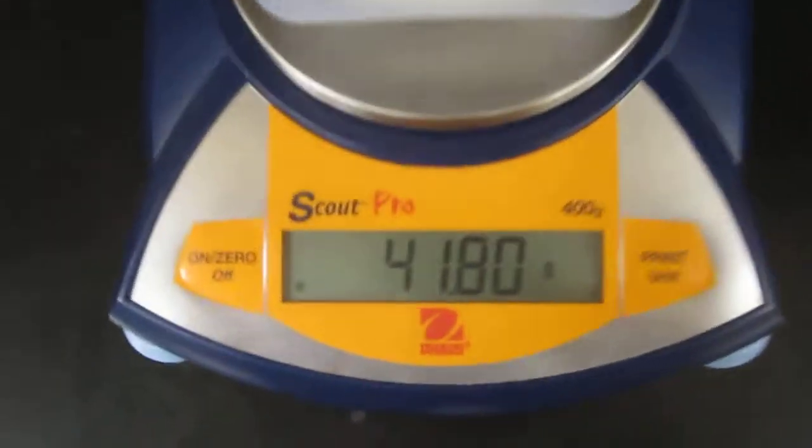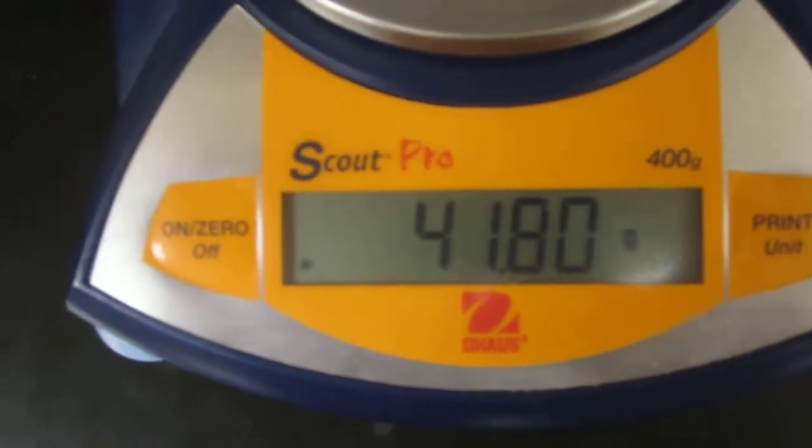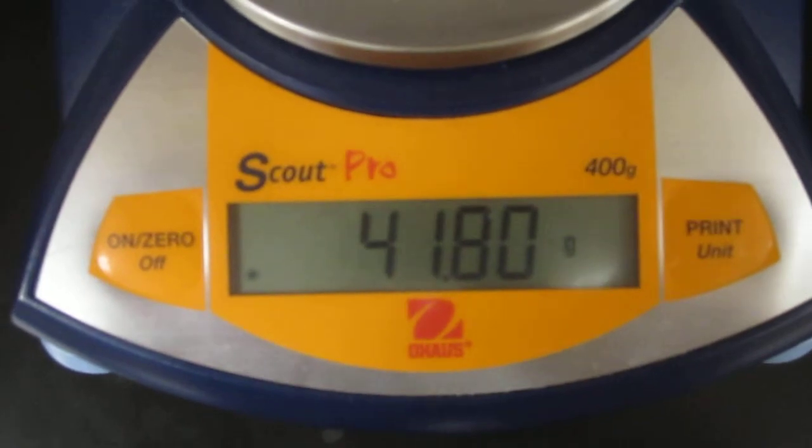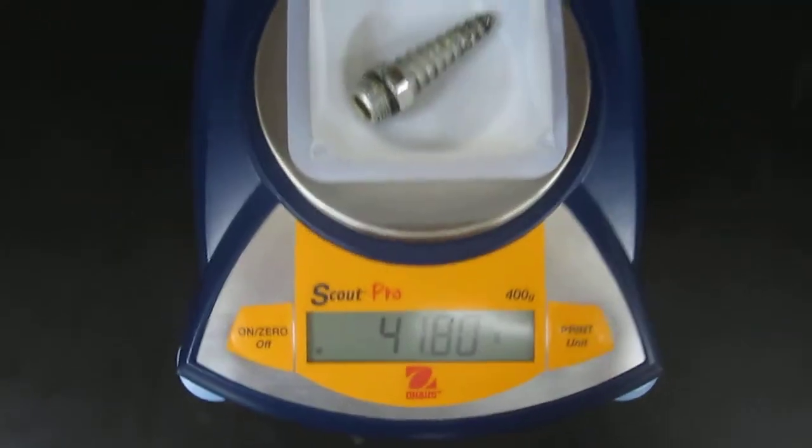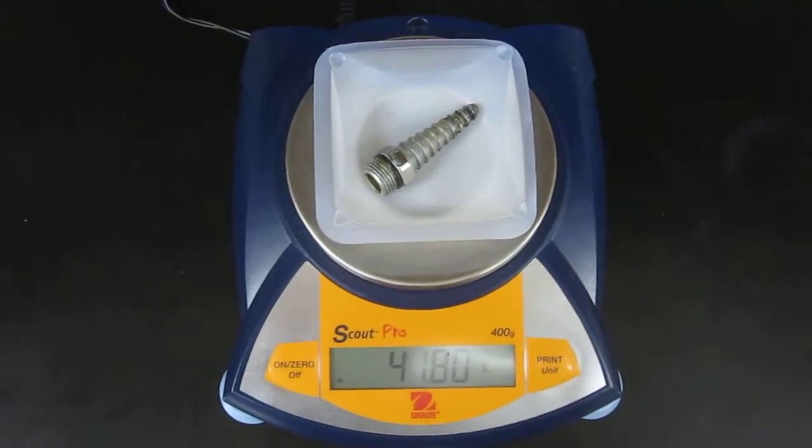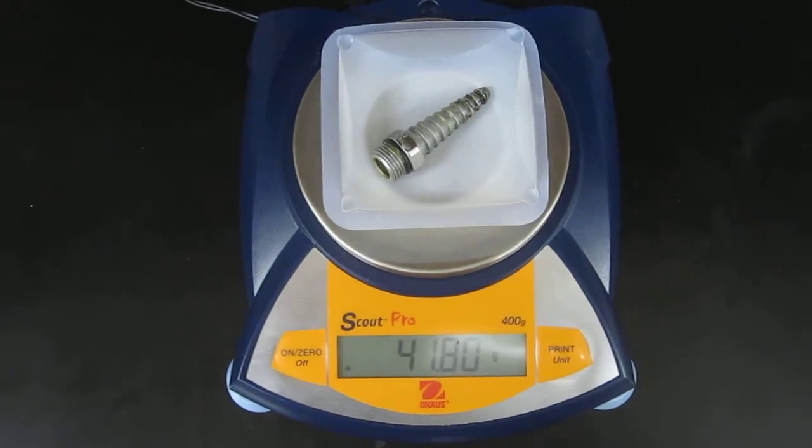So you can see the irregular object weighs 41.80 grams. So we are going to use that mass measurement to eventually figure out the density.